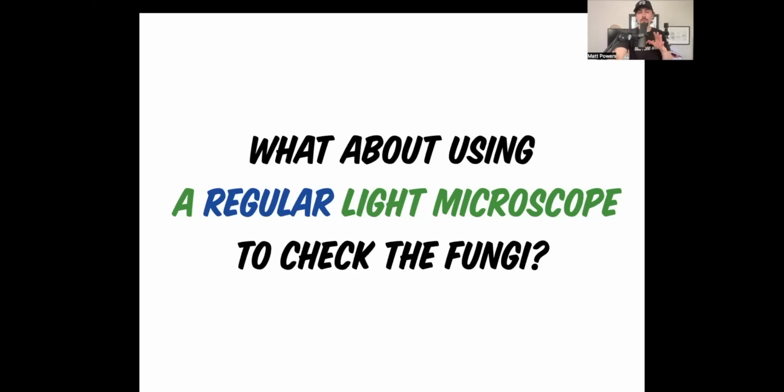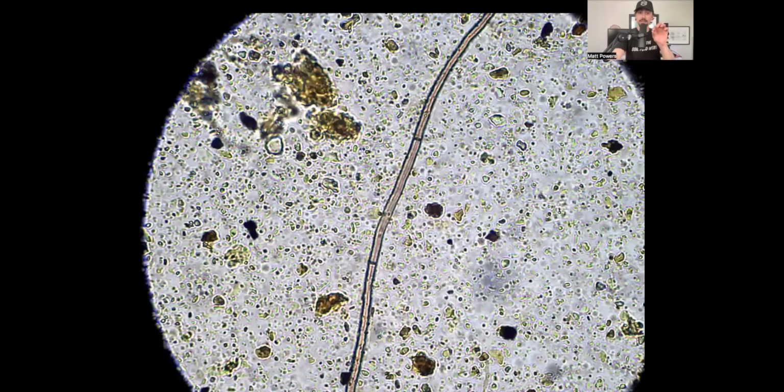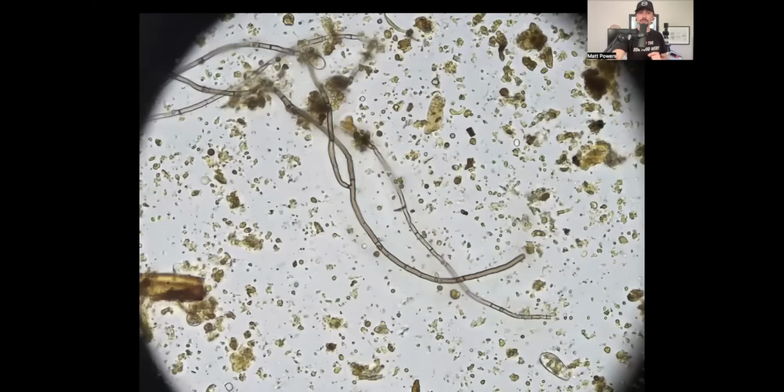But what about using a regular light microscope to check fungi? You might be asking yourself that. Like this, you can clearly see the separations, clearly see that it's a strand of fungal hyphae. Yeah, it's cool. This is great. But this is not the end, right? This is just the saprophyte breakdown, right? And so this is just a part of soil creation, part of decomposition cycling.